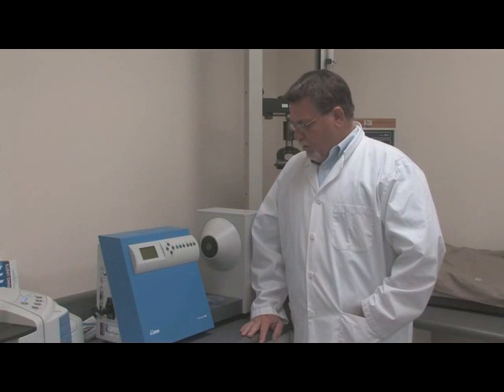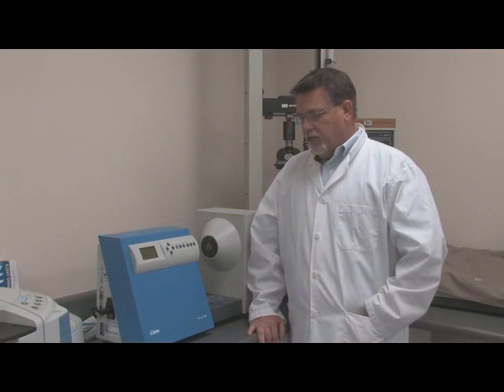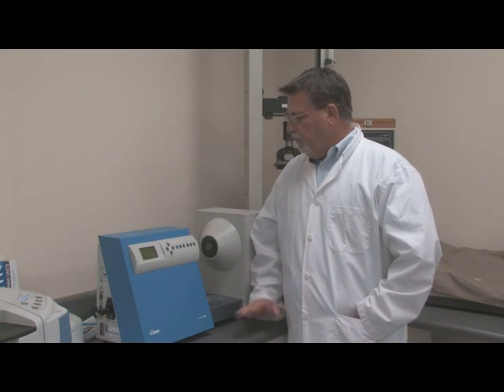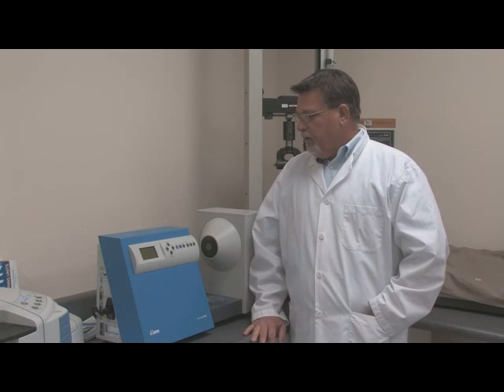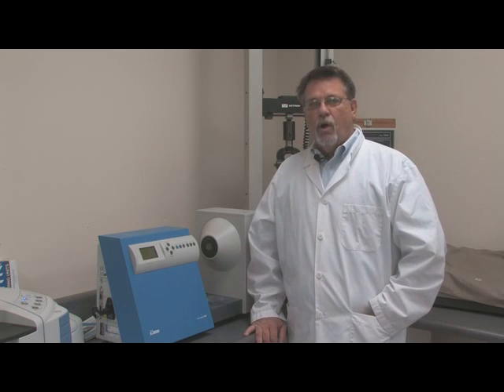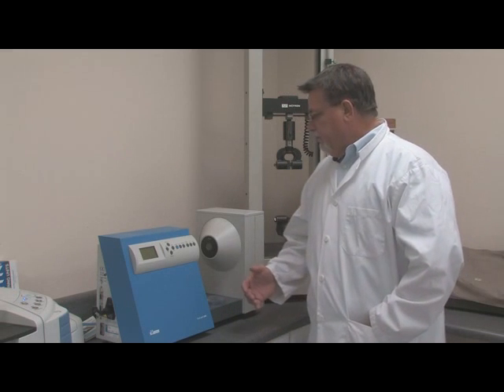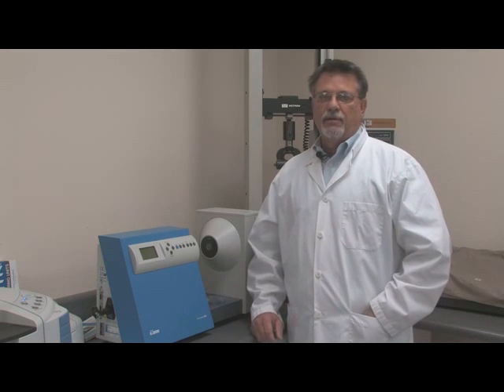Now, this little machine here is what's called a Haze Guard. It's an optical evaluation device, and what we're looking for here is some of the standard optical qualities of plastics. Haze, transmission, clarity, things like this.